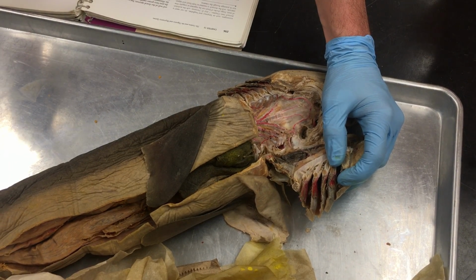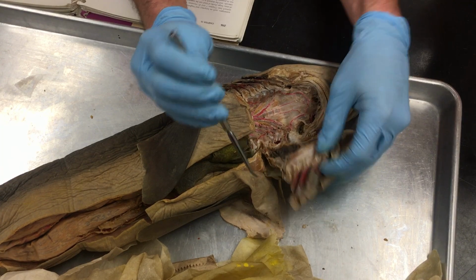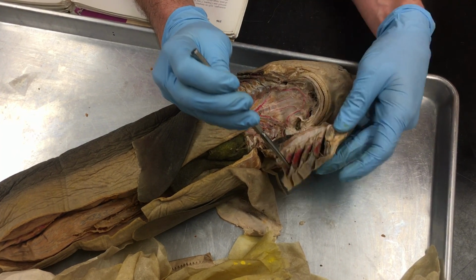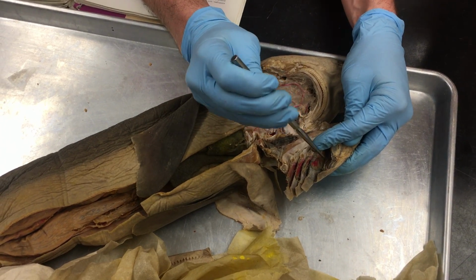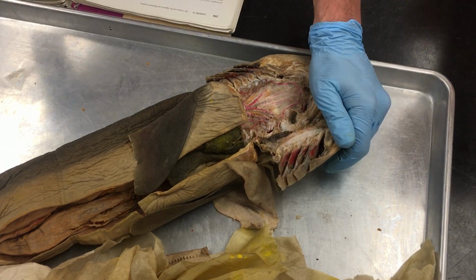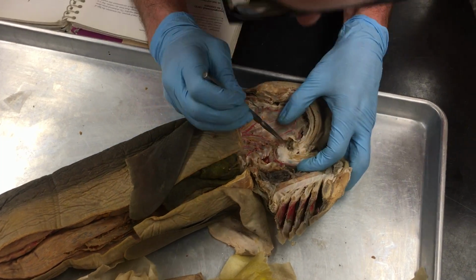Okay, holobranch and hemibranch gills. So these gills back here that have lamellae on both sides are holobranchs. The hemibranch is the very first gill, which has gill lamellae only on one side. So this one is the hemibranch, the very first gill. And then the pseudobranch is the pseudobranch slash spiracular valve or flap.